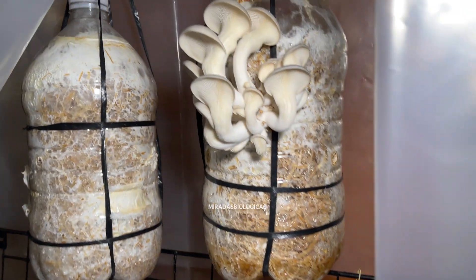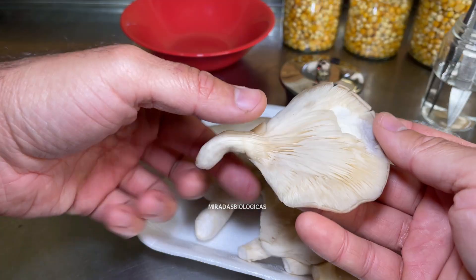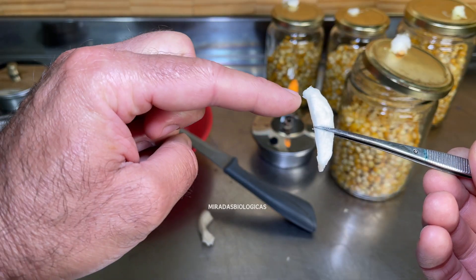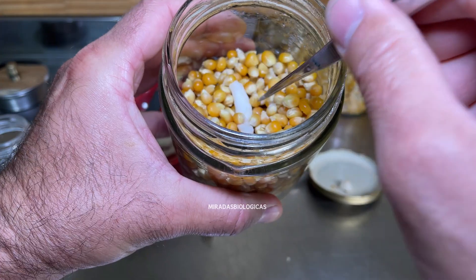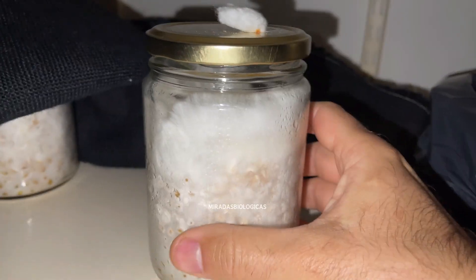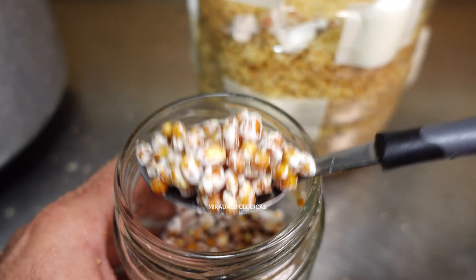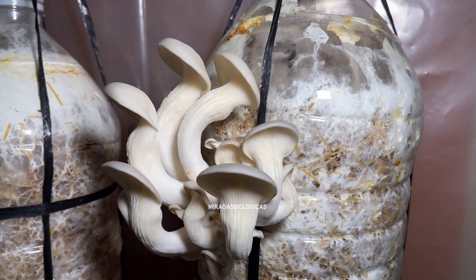In today's video, I'm going to show you how to grow mushrooms directly from the ones we can get at the market, such as oyster mushrooms. In this first part, we're going to isolate the mushroom so we can grow it in jars directly on corn kernels. And in a second video, when the corn kernels are completely white, we'll use them to grow these mushrooms directly in bottles.